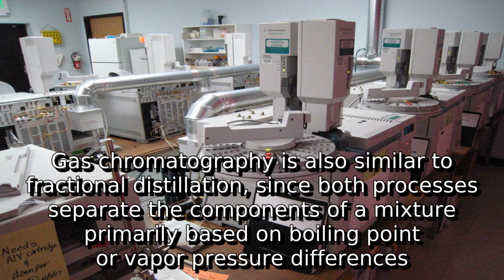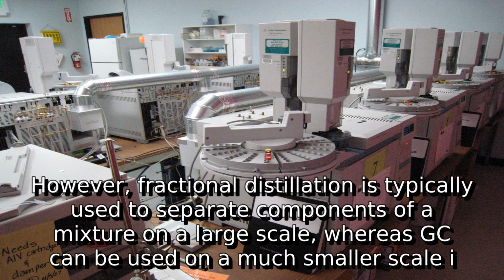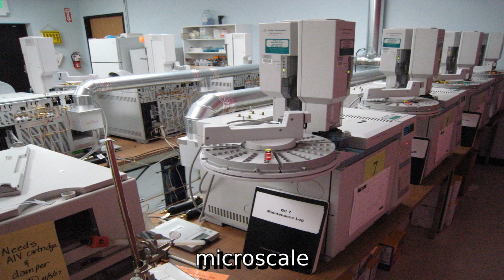Gas chromatography is also similar to fractional distillation, since both processes separate the components of a mixture primarily based on boiling point or vapor pressure differences. However, fractional distillation is typically used to separate components of a mixture on a large scale, whereas GC can be used on a much smaller scale, i.e., microscale.